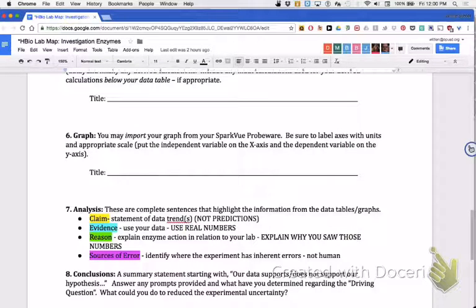And it's so cool on these graphs in the Pasco ProbeWare that you will be using, that app on your iPad. You can have all your runs show up just on one graph. And I'll have you practice it a couple times before, obviously, you do the real deal. Okay, then you'll make your claim, your evidence, your reason, and then your conclusion.